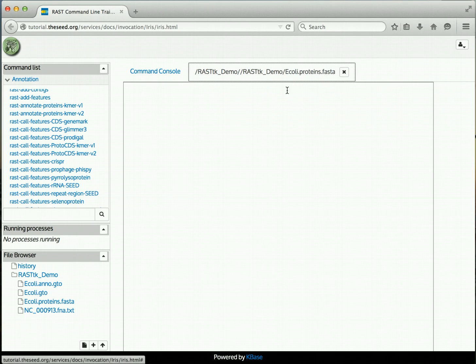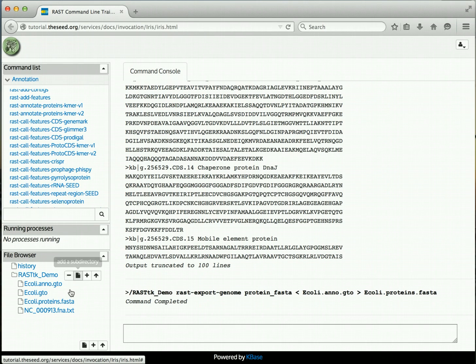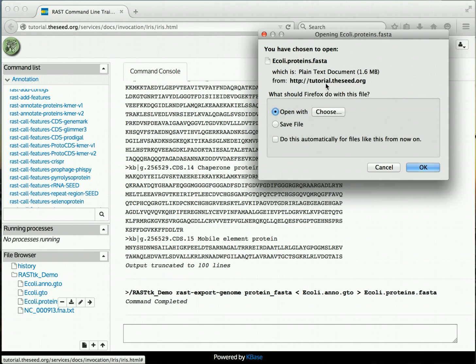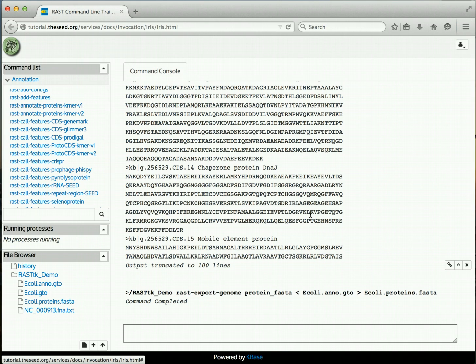But if you wanted to actually edit the annotation before you downloaded it, this is where that would happen. The other button I want to show you is the download button, and that will bring up a downloading menu in which you can determine how you want this to end up on your computer, in which case you would be done if this is what you wanted. But I will cancel out of that.